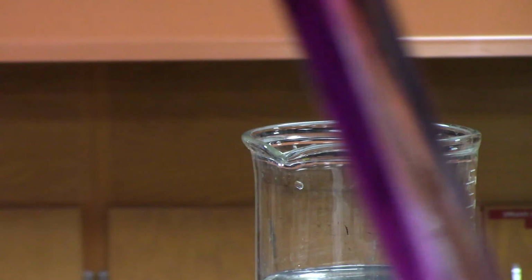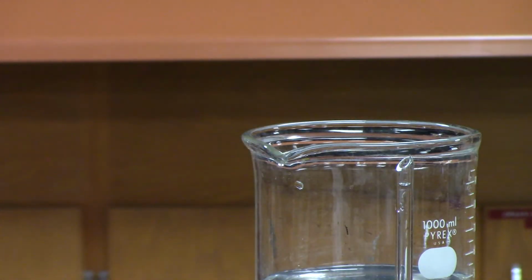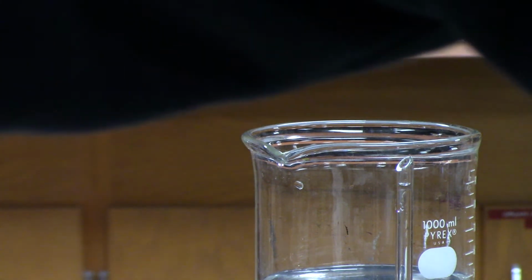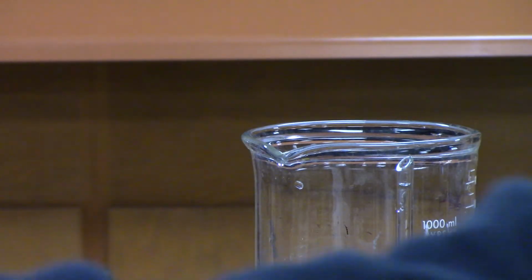Okay, and basically I'm going to turn it upside down. Alright. Okay, that's mixed. I'm just going to set this aside now. I'm going to be using that one in a minute to make up my next one. So next one I'm going to do is number 2, and basically go through the same process. Instead of using a stock, I'm going to use number 1 to make up number 2.